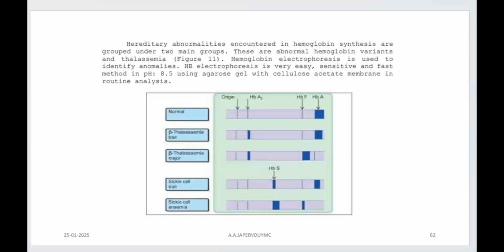So what you have is the bands which are generated, and those are compared here in this diagram. What are those bands? You have 1, 2, 3, 4, 5 bands, right? So these horizontal bands are nothing but the gel strips, right? So this is gel 1, gel 2, gel 3, gel 4, gel 5. Now, what are these gels for? The first gel, or you can say first well in the entire gel. See, blue is considered as a single gel, and these are the different wells. That is how you can look at it. That is not very important.